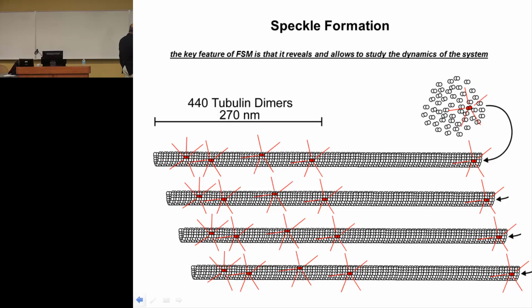So this is one dimer. What you need is between 4 and 7 of them to be labeled to pop up. If I have now 4 or 5, another one here is stochastically added, another one is removed. Also they moved. So every feature lies on multiple fibers. So it's not only one, which means that if they move left or right, in any direction, you change the intensity.